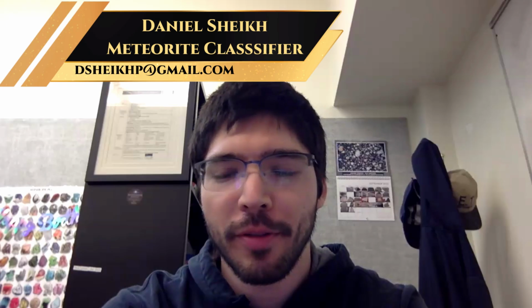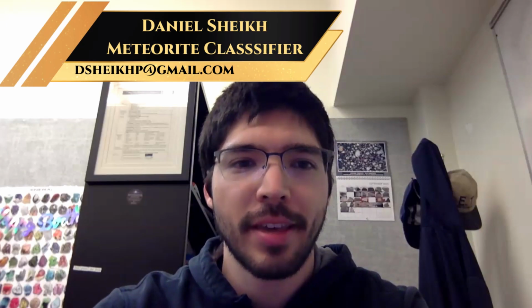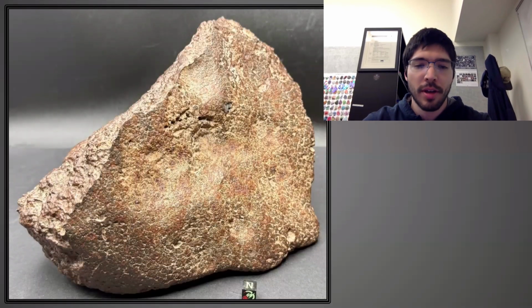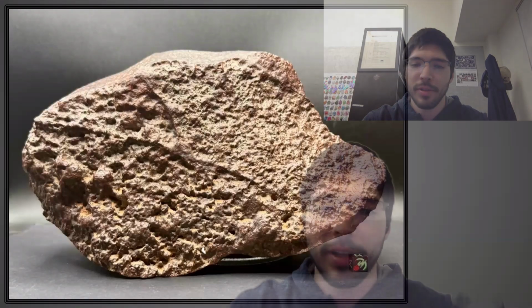Yeah, this is going to be a very exciting segment, indeed, especially the third part, since for the first time, I believe, ever, we're going to see the actual submission process to the nomenclature committee of the Meteoritical Bulletin database for a sample, which I think adds full transparency into the entire classification process. So really excited for that.